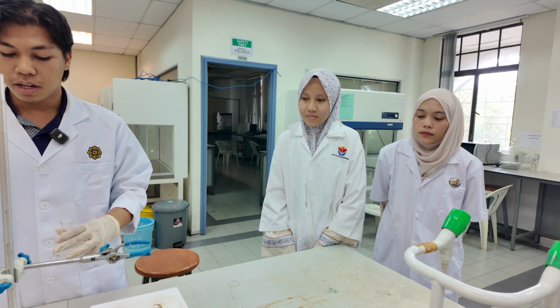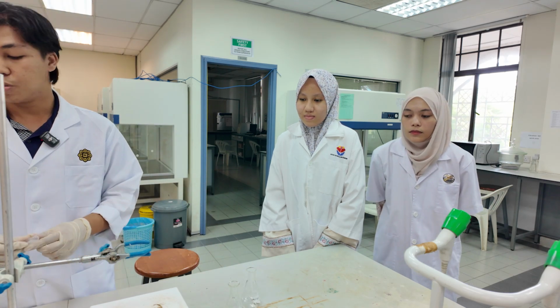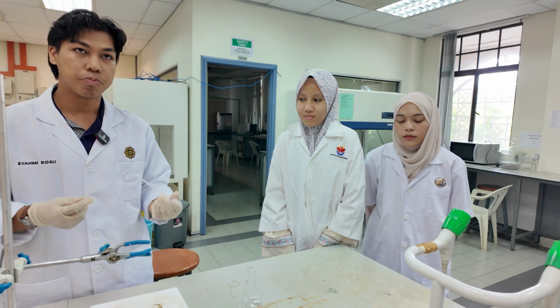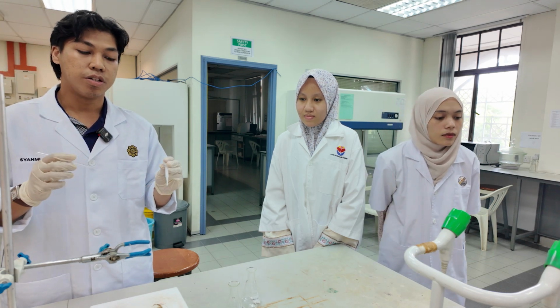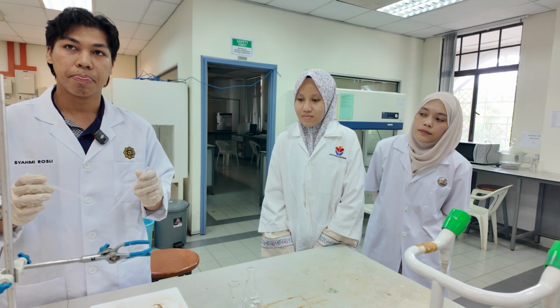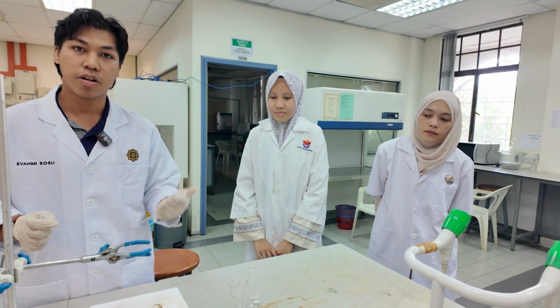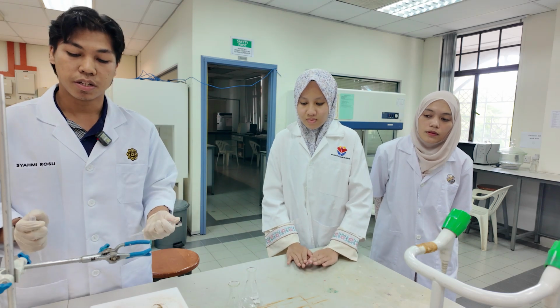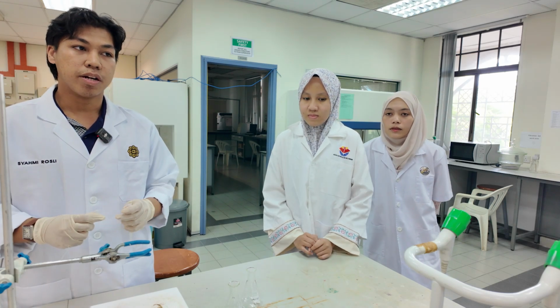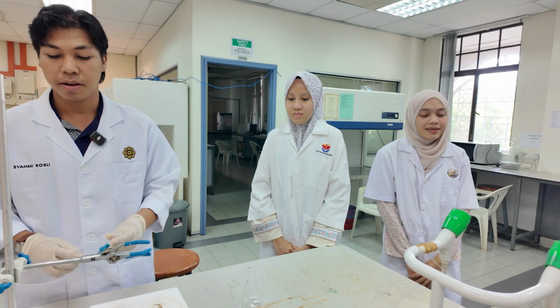Make sure you don't use the same dropper for the solutions I mentioned just now, the methanol, the hexane, the water, because you don't want any hexane in the mixture flask, and you don't want any methanol in the single flask.